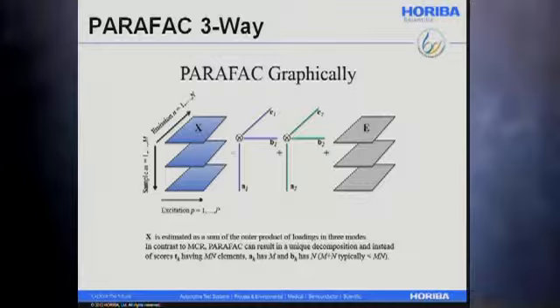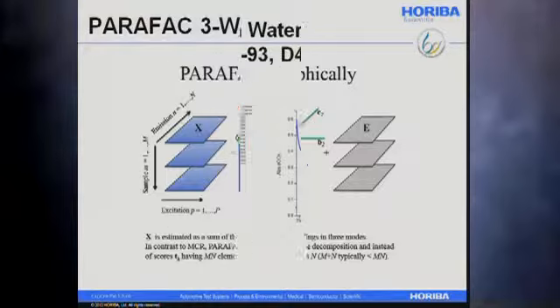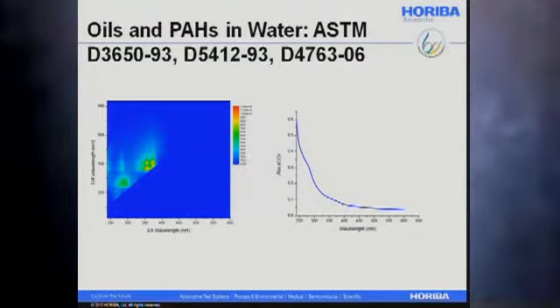So this parafac tool has been shown to correlate very highly with a number of water contamination and disinfection byproduct applications. This being one example of oil in water, the system also facilitates a number of oil and water applications with this method in terms of identifying oil by evaluating the EEM and synchronous profiles of the EEM.